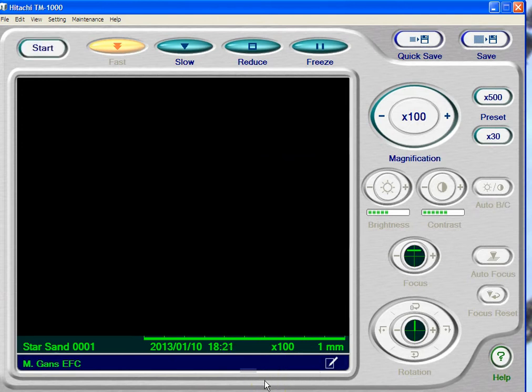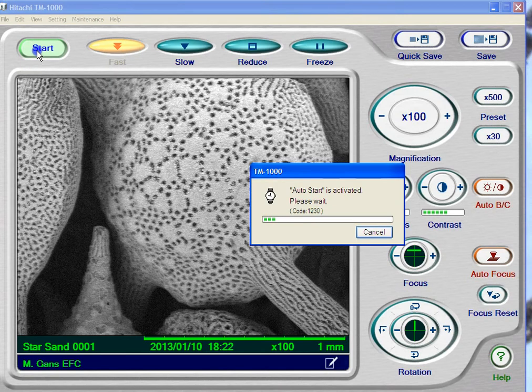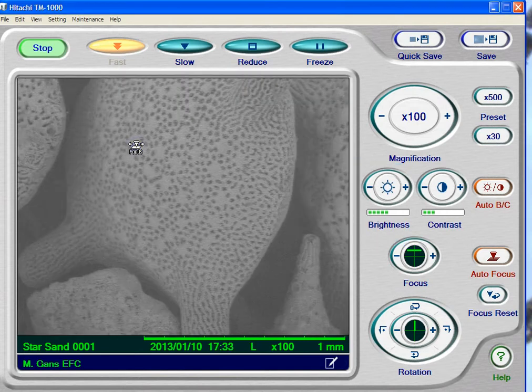The scope has finished evacuating the chamber. We know that because the message has gone, and you've got this start button which is now no longer grayed out. So all you have to do is hit the start button. There's an auto start, in which case the scope takes a first look — it'll do a quick autofocus and adjust the brightness and magnification. If you don't see an image even in this window, there are two reasons: the scope might be misaligned, but more likely you forgot to center the stage, so the specimen is way off to the side and the scope is trying to focus into thin air. So there's our first specimen — this is a little star sand.